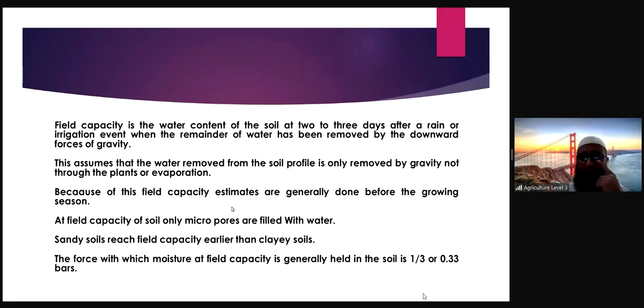Field capacity estimates are generally done before the growing season, as I have told you. At field capacity of soil, only the micropores contain water, and all the macropores are filled with air.